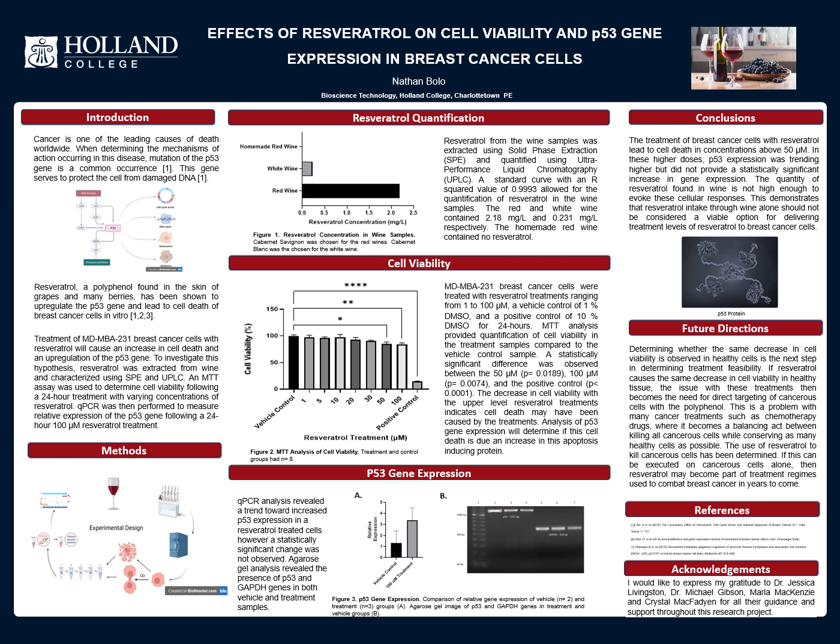The treatment of breast cancer cells with resveratrol led to cell death in concentrations above 50 micromolar, but did not lead to a significant difference in p53 gene expression. The quantity of resveratrol found in the red wine, equating to approximately a 10 micromolar concentration, was not enough to evoke these cellular responses. This suggests that resveratrol levels found in wine are approximately 5 times lower than the treatment level required to provide a decrease in cellular viability in breast cancer cells.